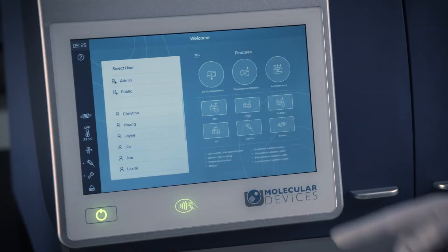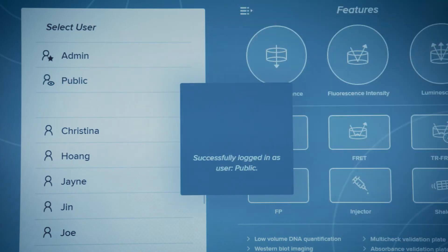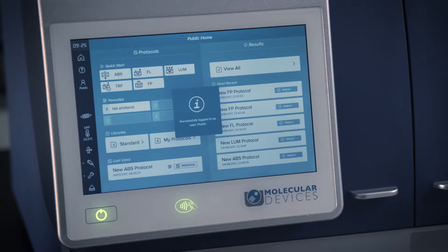When you start the reader for the first time, you will see login options for admin and public. The public user is available to any user of the instrument and is not PIN protected.